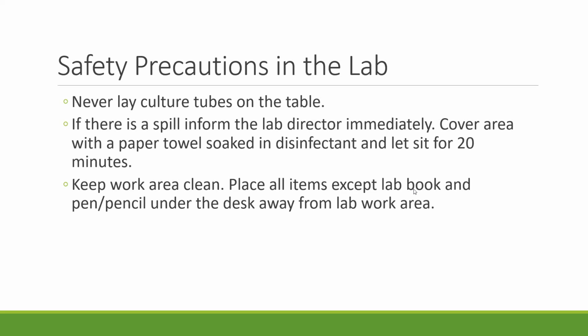When you are looking at a lab, test tubes are a lot of what we do in microbiology lab. One of the things I always remind students is to be very cognizant of how you're handling a test tube. Why? Because if we're using a test tube, 9 out of 10 times it's got a liquid in it. So you need to be real careful that you're setting it into a test tube rack and that it's sturdy in that rack. You don't lay it on the table or lean it up against something, because then it has the potential of falling over and spilling.